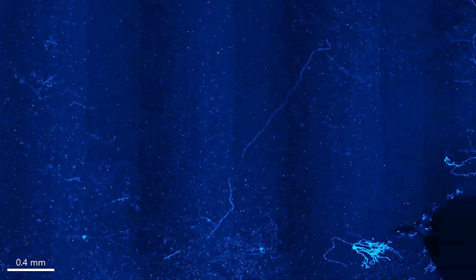Really what we're trying to do in this anatomy group is to map the projections of individual neurons from one brain region to another.